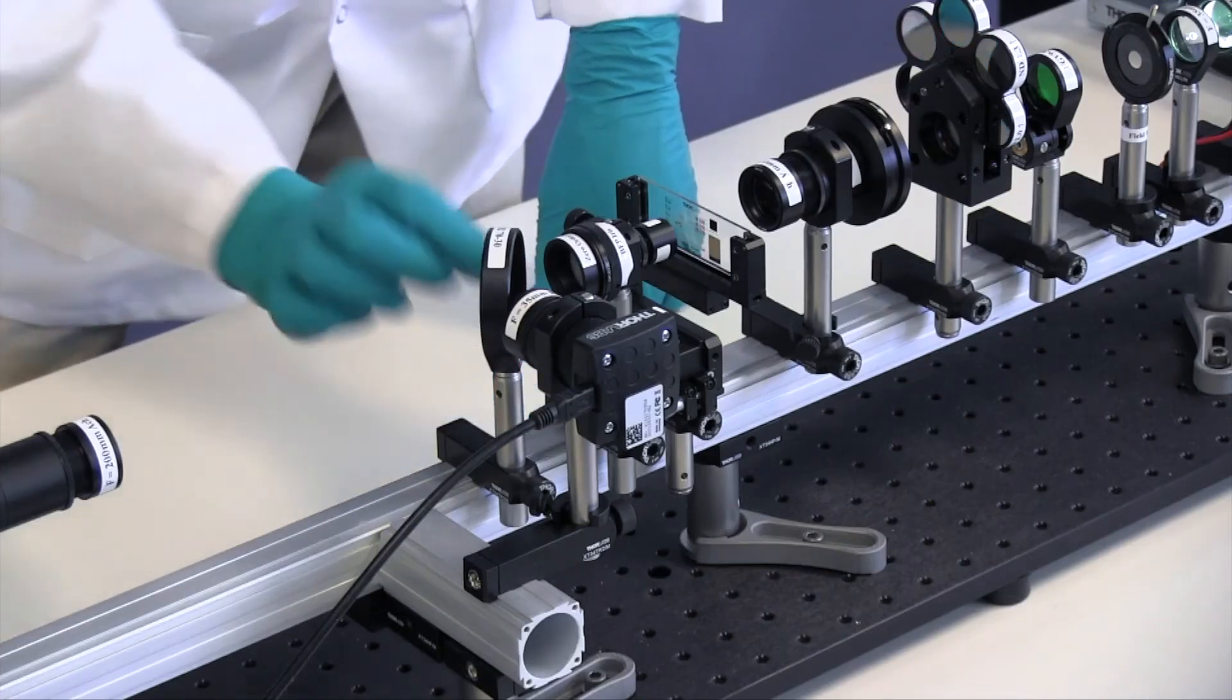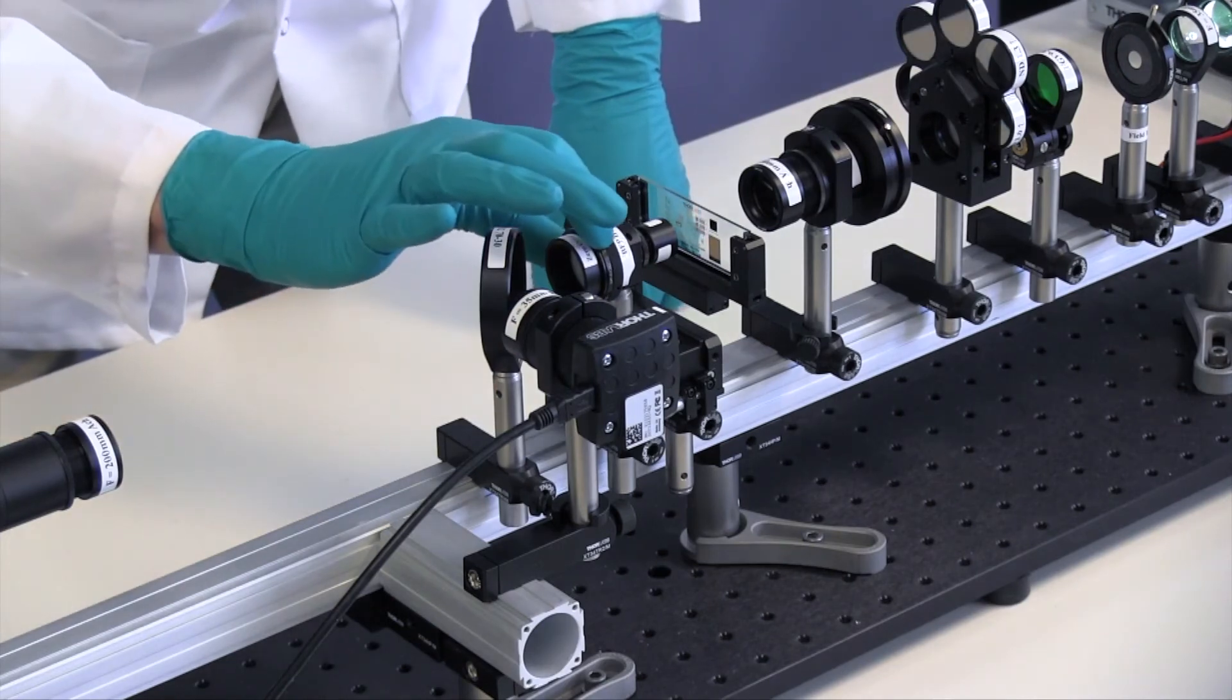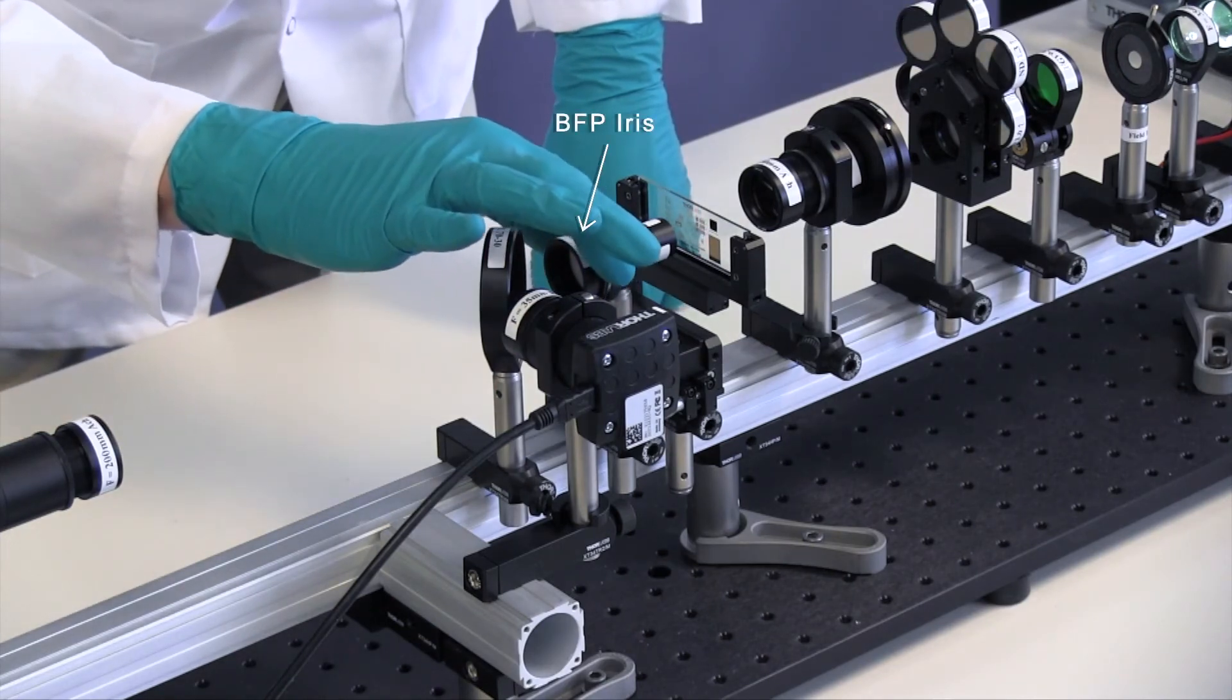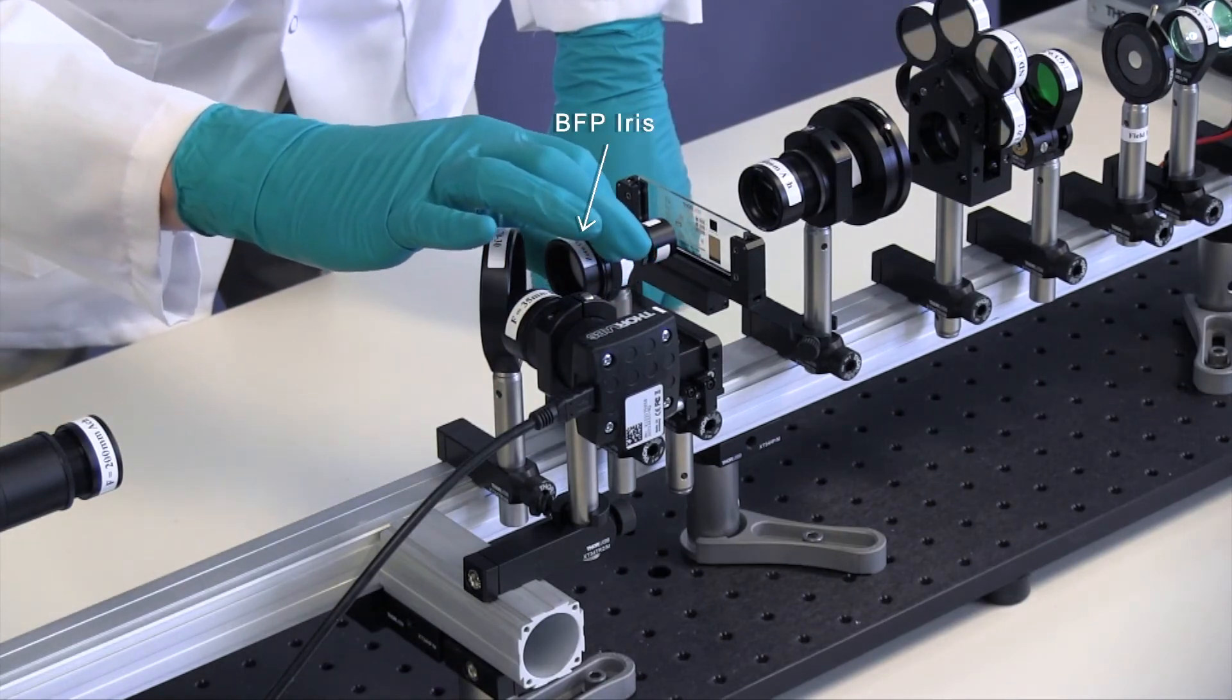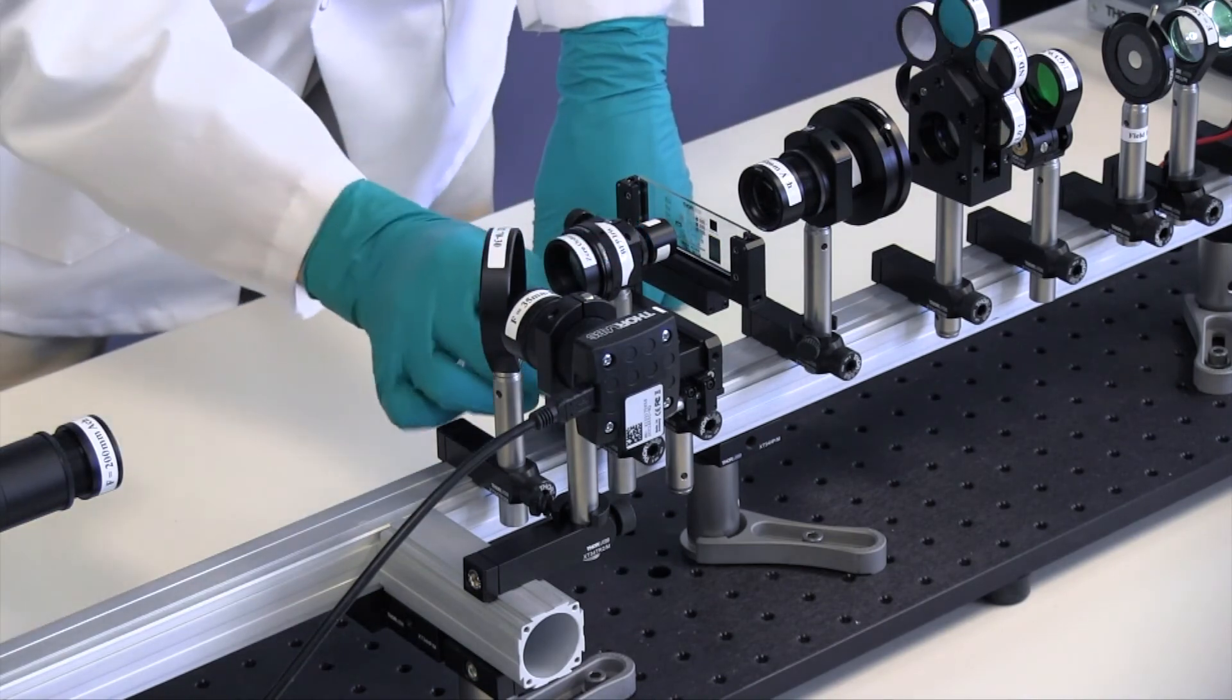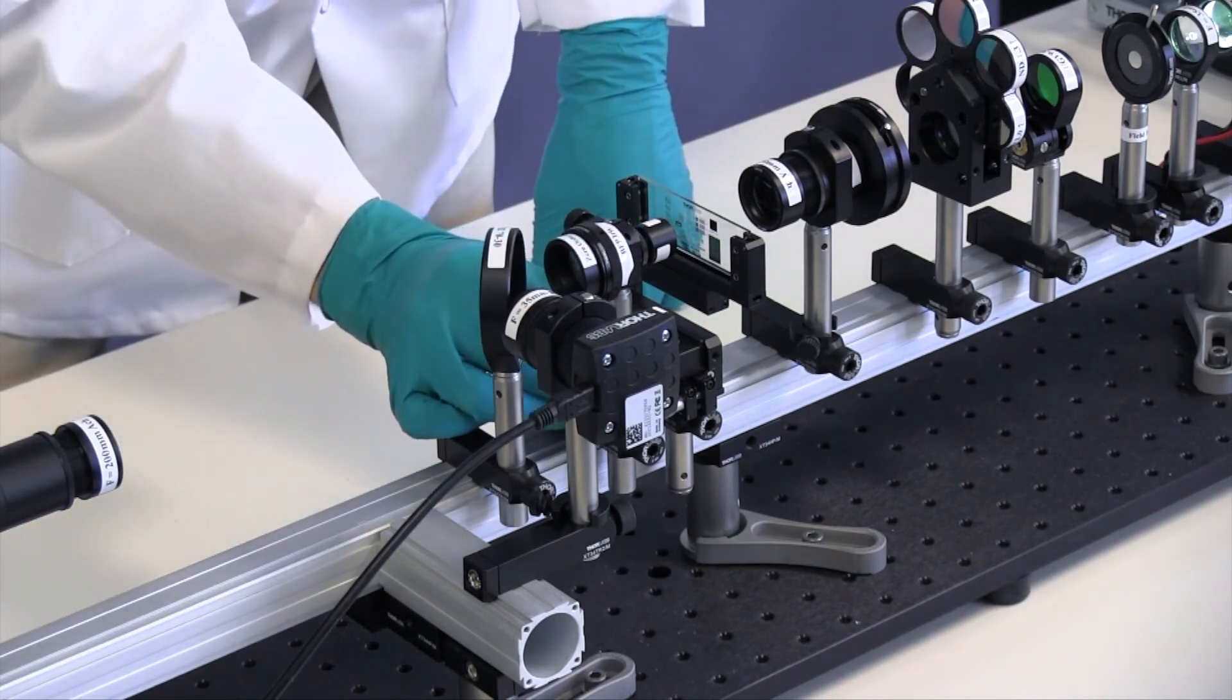Next, close down the BFP iris on the aperture iris. Adjust the angle of the objective so the two irises close evenly on one another.